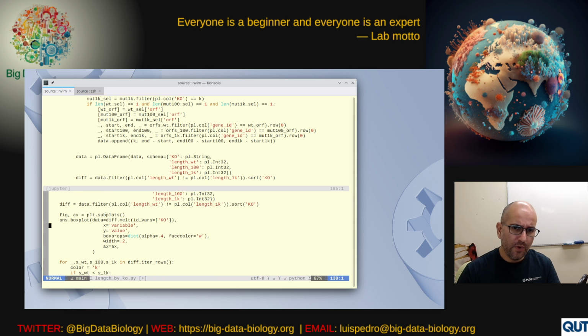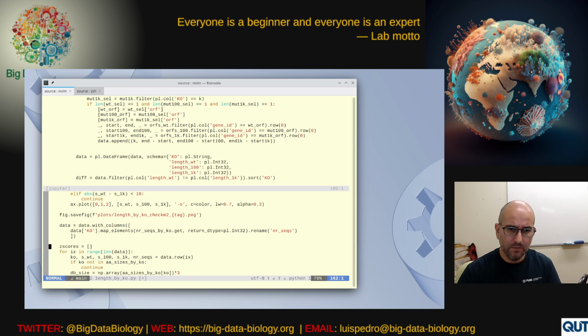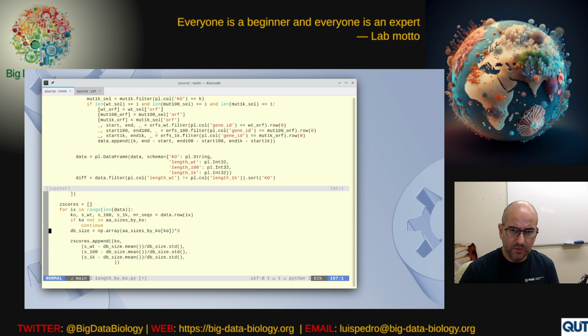So we've also decided, or I decided, that just because of how this has grown a little bit with just random code addition, it really does need to be cleaned up and refactored. So for example, all of this code that I had to pause the video for, which runs parsing the big FASTA file, this should have been done one time and then saved. So we will do a lot of that cleanup next time. But in the meanwhile, this is what we had.